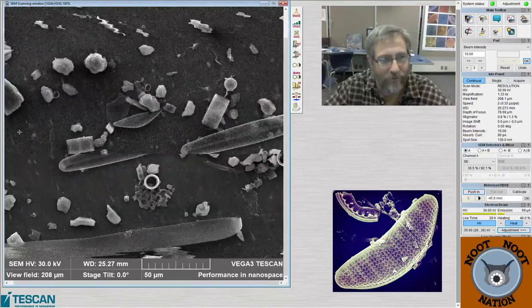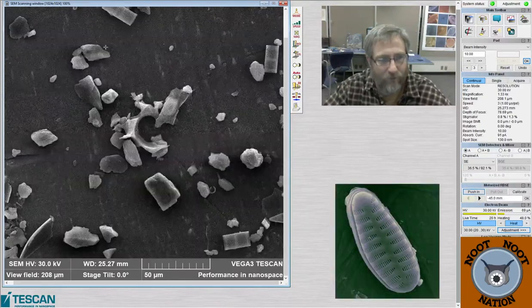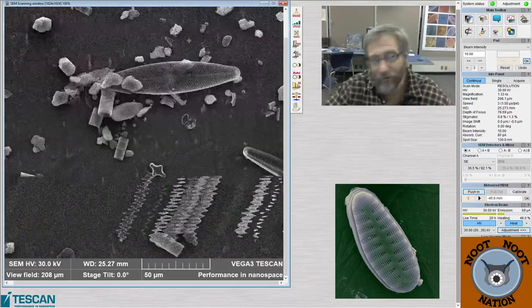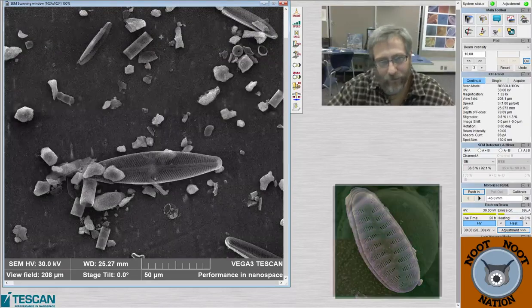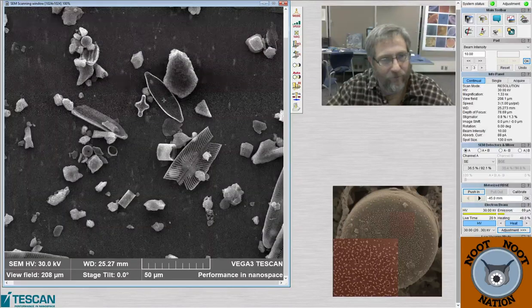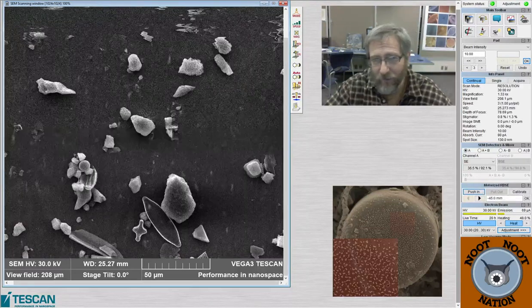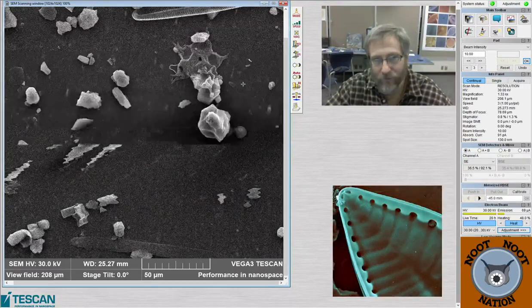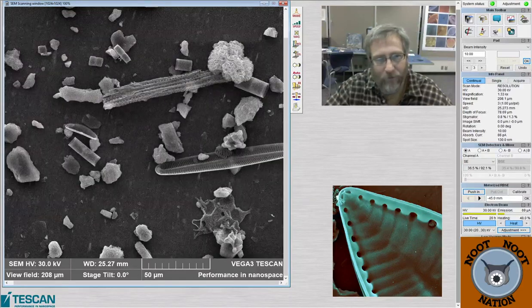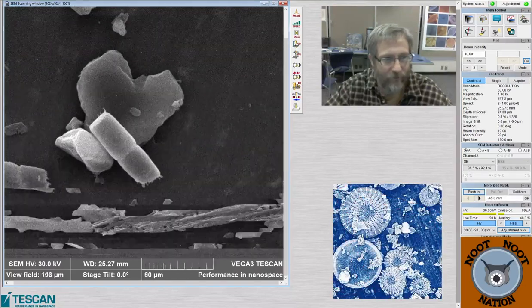We've tried it again. We did try to do it with another diatom, with an anumastis, which isn't round. And I thought maybe it would go a little bit better. But for some reason, the Agisoft software couldn't figure out how to place the pictures correctly. I don't know what we did wrong, whether it was the way the picture was taken, or the resolution, or the size of the images changing a little bit. Normally those things wouldn't be a problem, or at least I'm told they wouldn't be. So I'm not sure what the issue was, and we never figured it out.